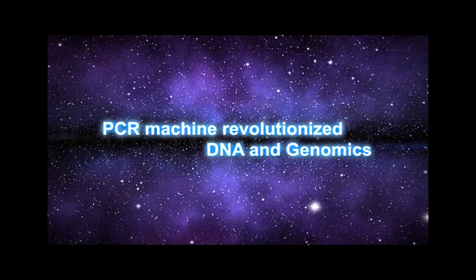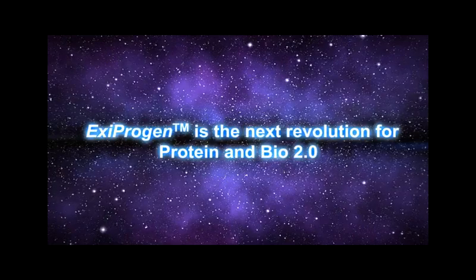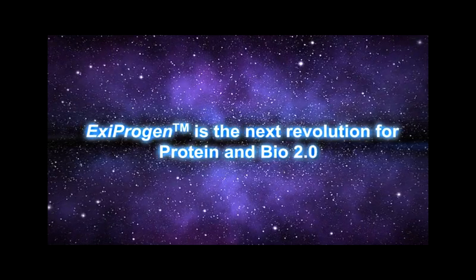PCR machines revolutionized DNA synthesis and genomics. Exiprogen is the next revolution for protein and bio 2.0. Introducing Exiprogen from Bioneer.